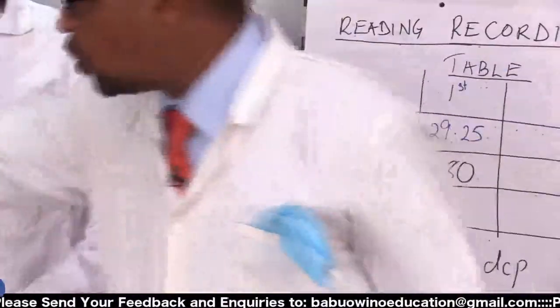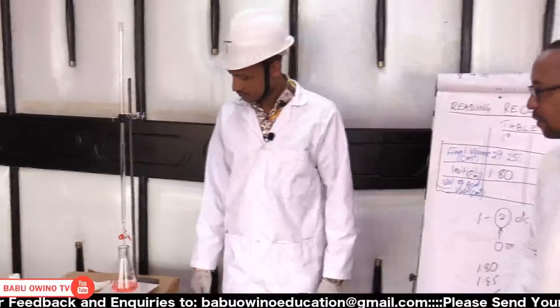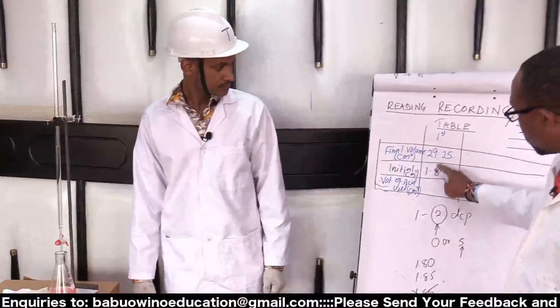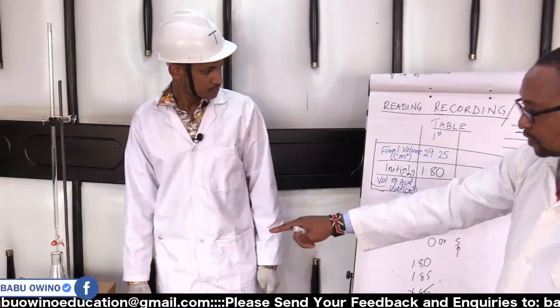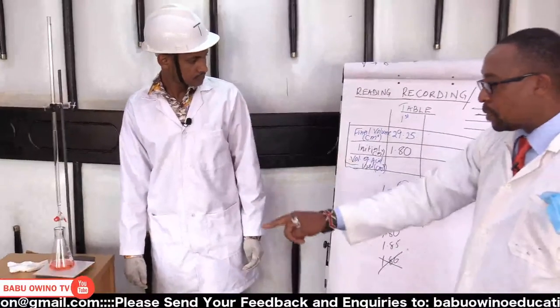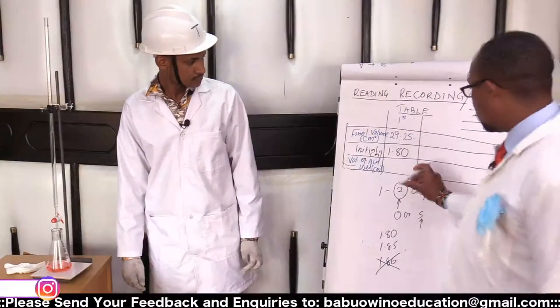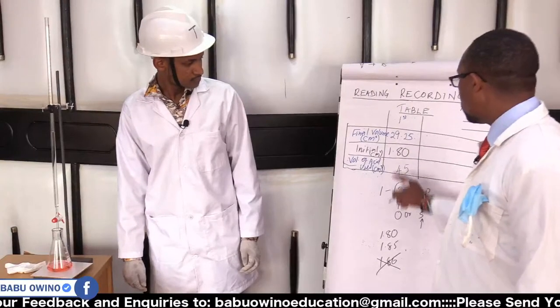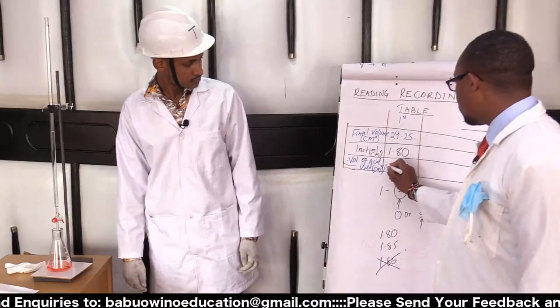We said that what is here is a titrant, and what we have here is a titer, and the process is therefore titration. This one from the burette is the titrant, and we are analyzing what is in the conical flask from the pipette, which is the analyte. So we do the subtraction. 12 minus 8 is 4. This is 8, we carried 1. This is 7.